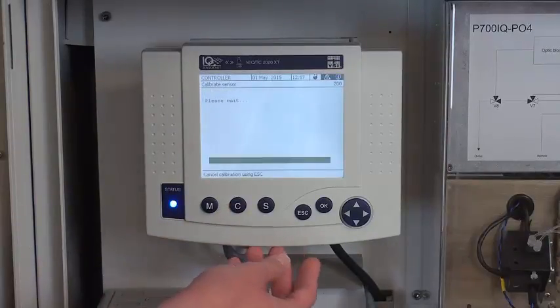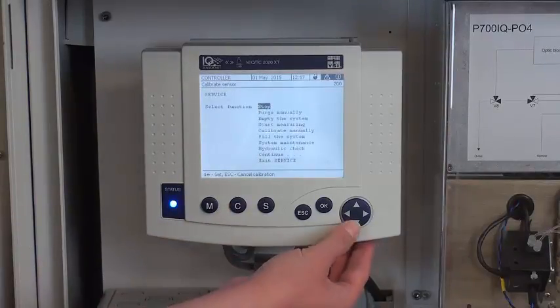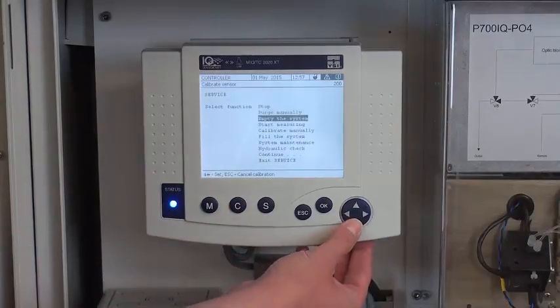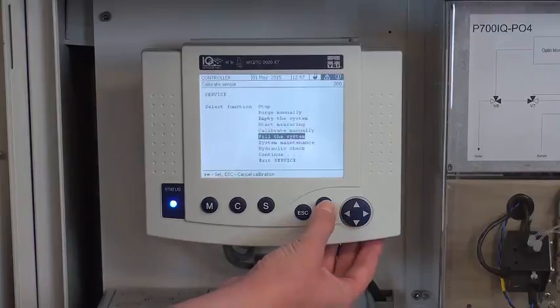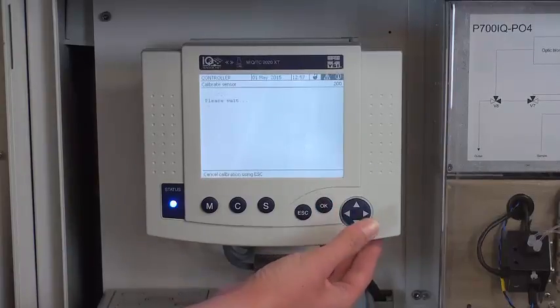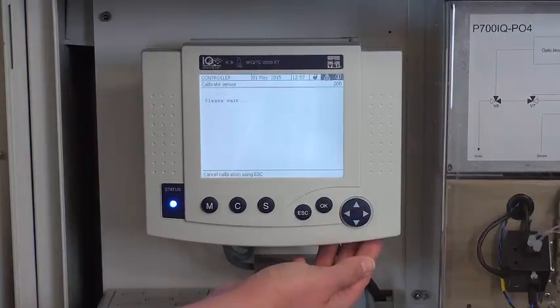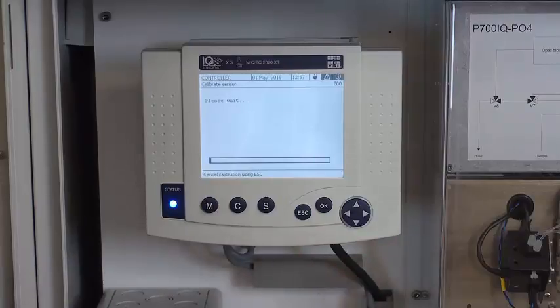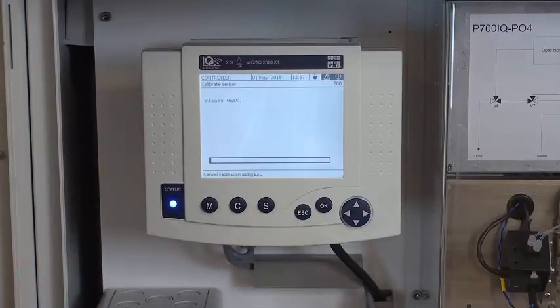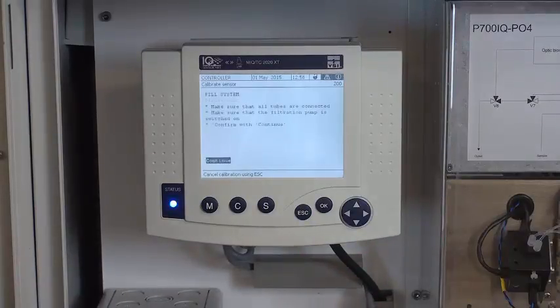So I press C and go down to fill the system. This may take a few minutes.